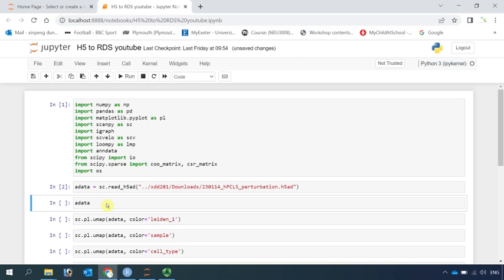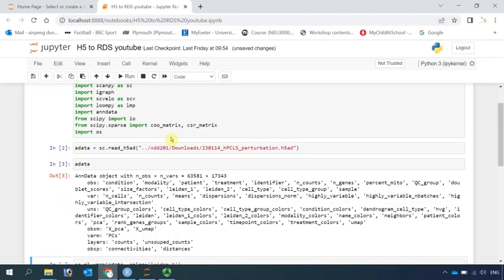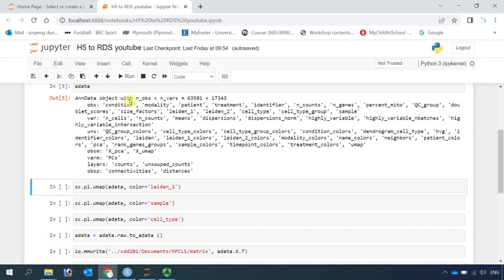So we can have a look at the data. This dataset has more than 63,000 cells and more than 17,000 genes. You can also see all the information from the observations and the variables. We can also see the dimensional reduction methods: PCA and UMAP.